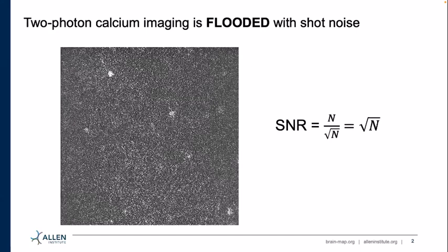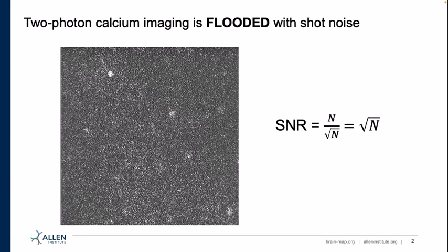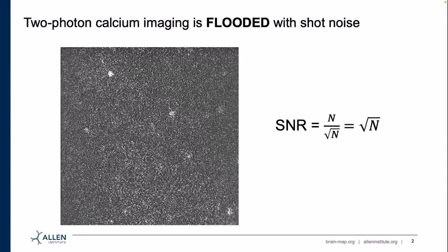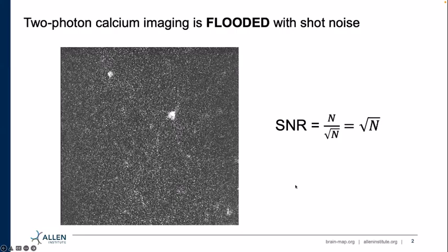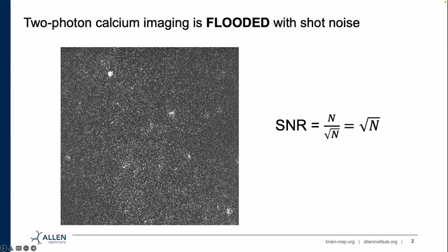As many of you know, noise is a huge issue in systems neuroscience. We are tackling neurons that are hidden in a skull and hard to reach. Any method we use to record neurons is prone to measurement errors. Two-photon calcium imaging in particular is flooded with shot noise. Here I have an example of a 30 Hz movie recorded at the Allen Institute, representative of typical experiments. The first thing you notice is all this speckle across the entire field of view.